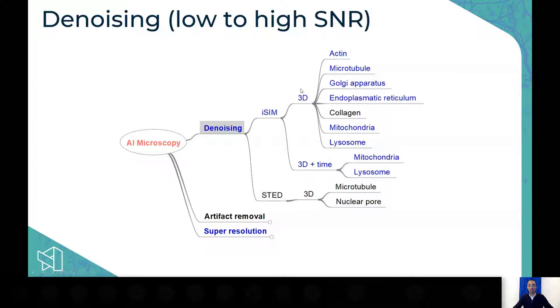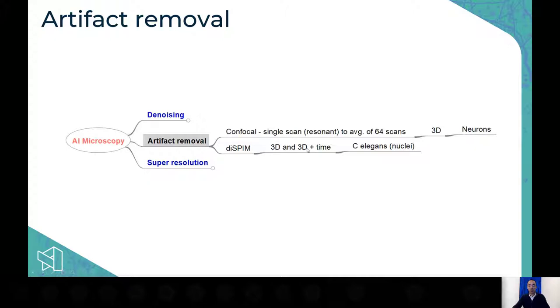For denoising, we used the iSIM and conducted experiments in 3D and 3D plus time. We studied quite a lot of organelles in 3D, and then applied models created in 3D to the 3D-plus-time dimension. The models were created for fixed 3D datasets, then applied on live 3D-plus-time samples — restoring the quality of live cell imaging by acquiring at low quality and restoring to high quality.